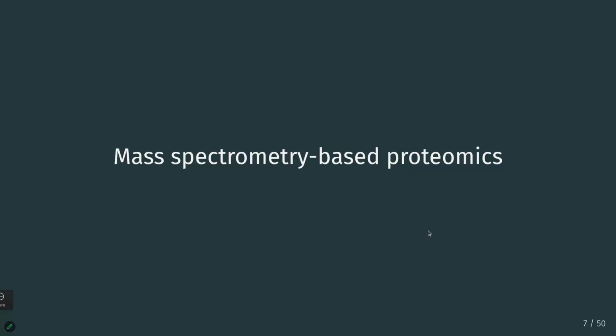So with a real show of hands, maybe, who is already familiar with mass spectrometry-based proteomics and maybe in particular identification? There you go. Oh, a bit of identification. I'm glad because I'll reel in more people into the dark side of identification in MS-based proteomics.